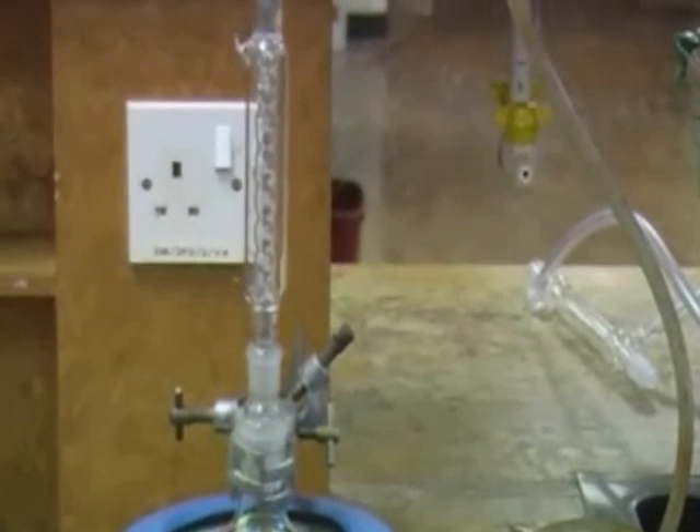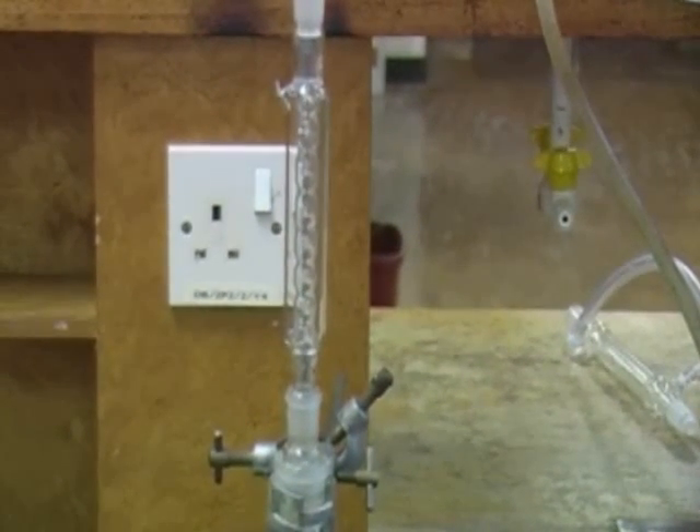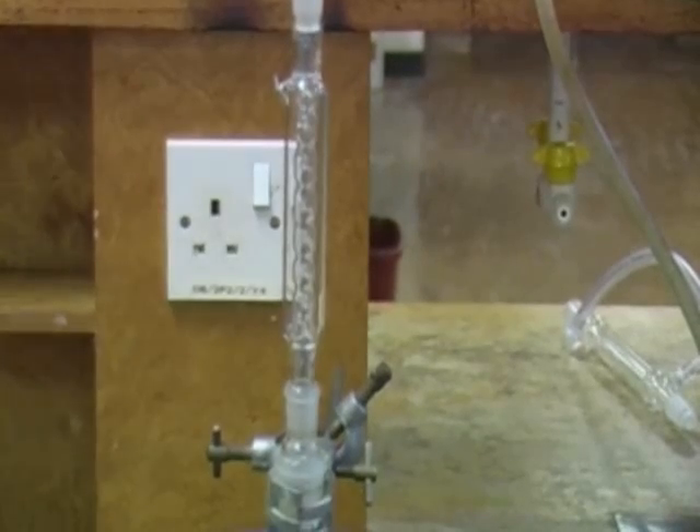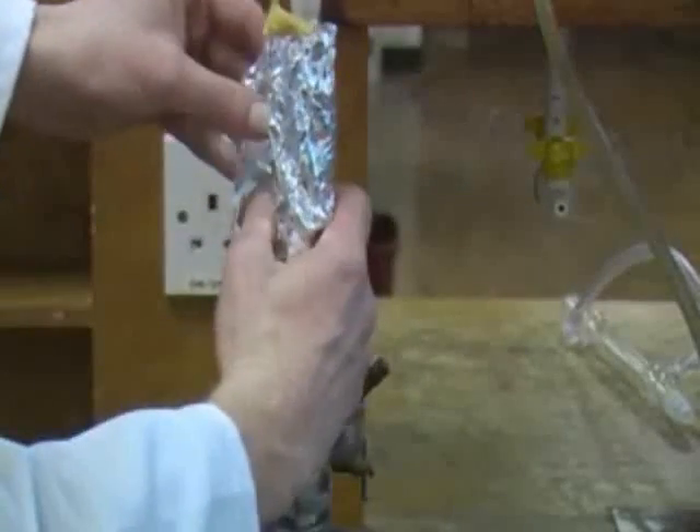There are a number of different types of fractionating column that you may use. It's wise to insulate the fractionating column with some lagging wrapped in foil, particularly if you're working in a fume hood where the air draft may cool the column down and slow down your distillation.